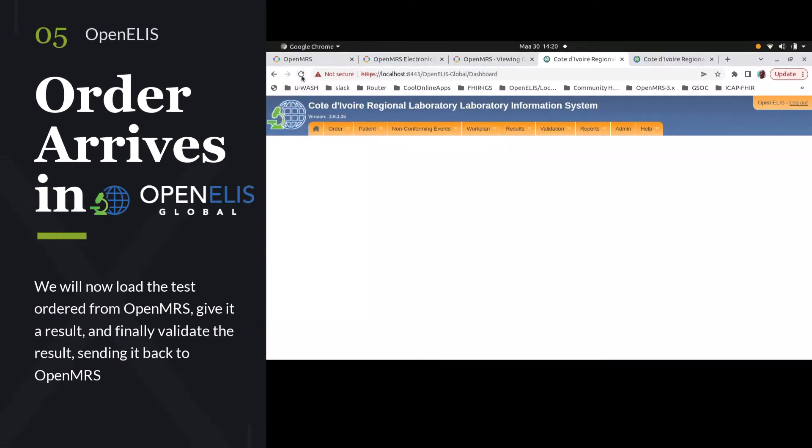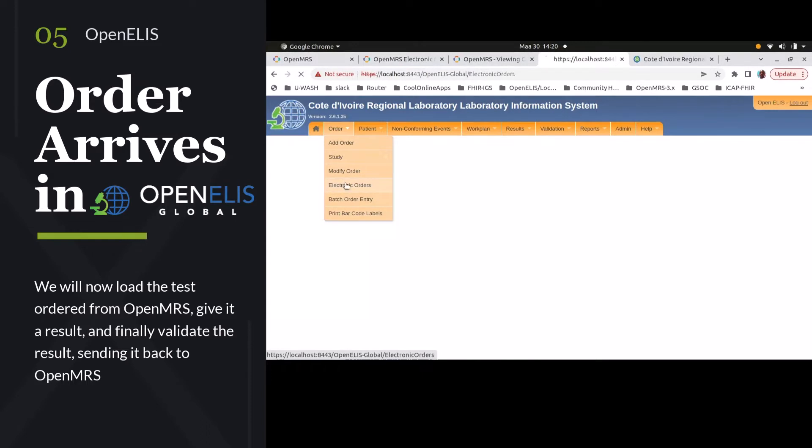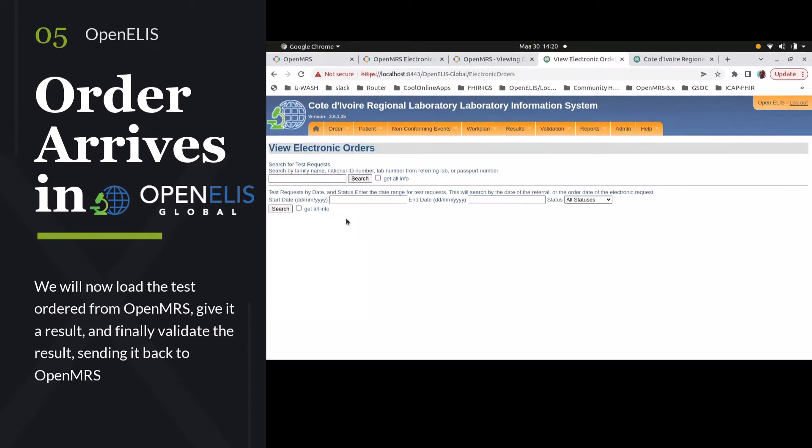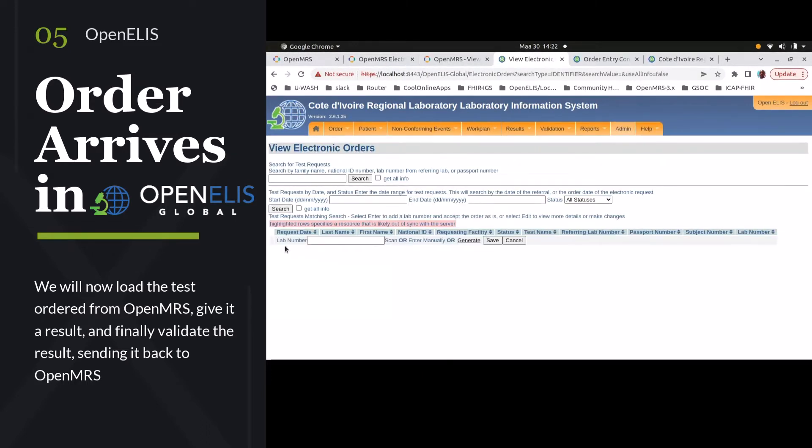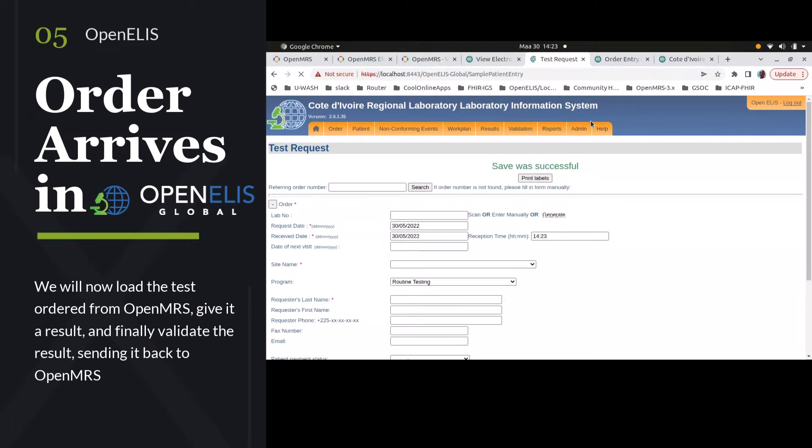So in OpenELIS itself, we're going to go to electronic orders where we see incoming orders. We're just going to search for everything. Here we can see our test patient and lab. We're going to go ahead and save that into the OpenELIS system.